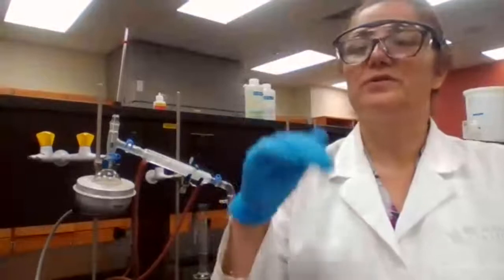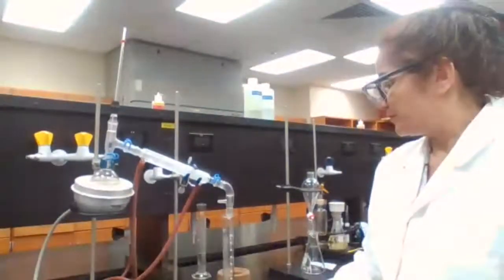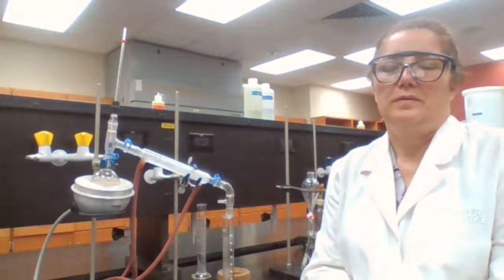Drain the lower aqueous layer, we don't need it. And then from the top, we get the amine. Very good. Good procedure. Okay. Do you have any questions? Questions?